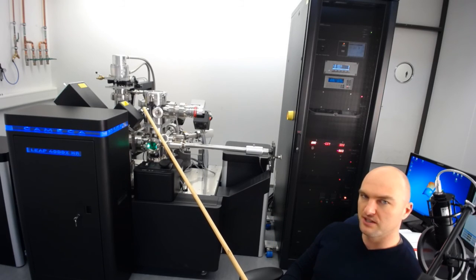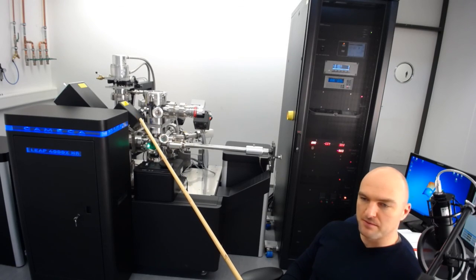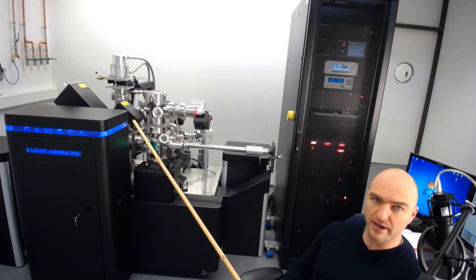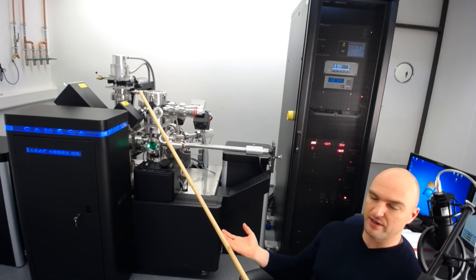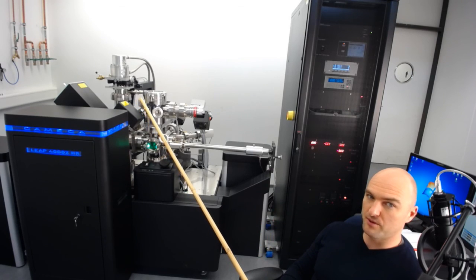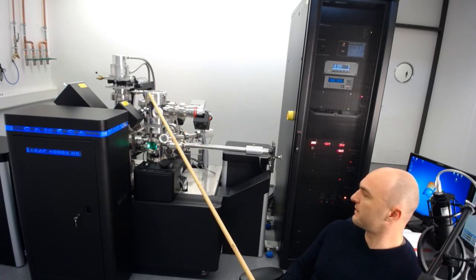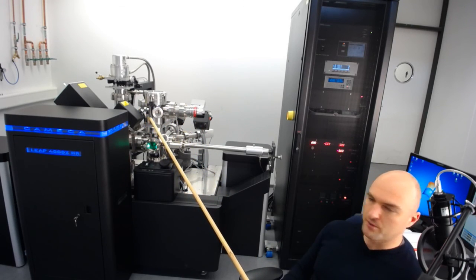Sometimes one part of the measurement gauge can be broken — you might get a reading in the low vacuum range but not the high vacuum range, or vice versa. If that happens, you know one part of the gauge is broken. If you do your own instrument maintenance, these are all standard parts from Pfeiffer, so you should be able to replace them and get it working again.